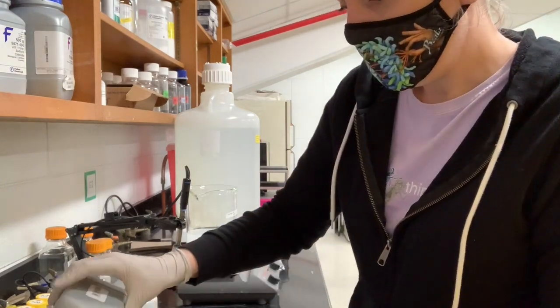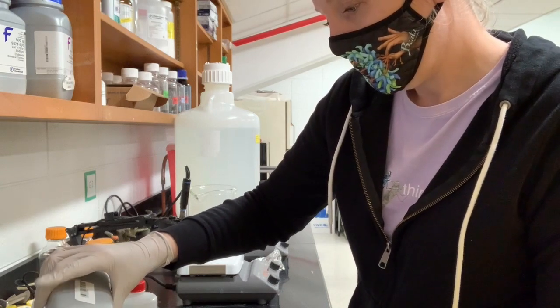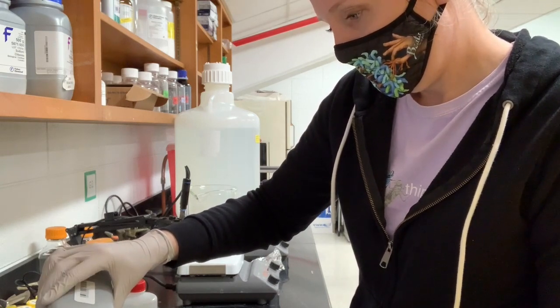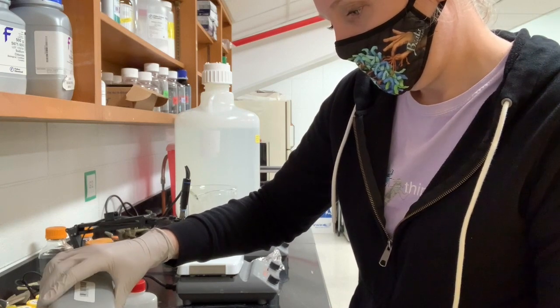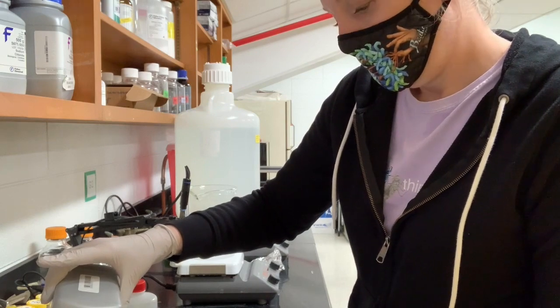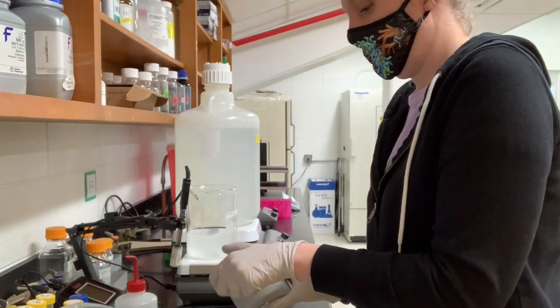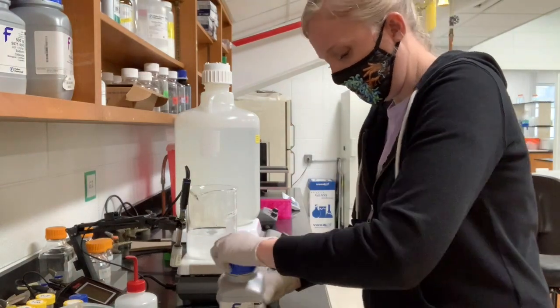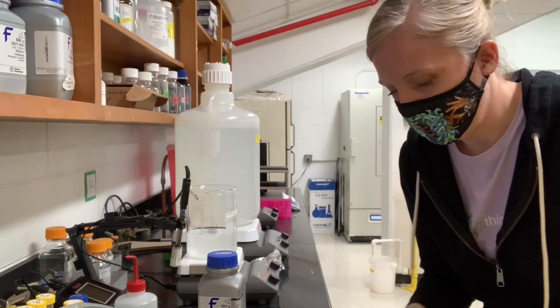So I only need 2.01 grams. I'm going to remove a little extra.